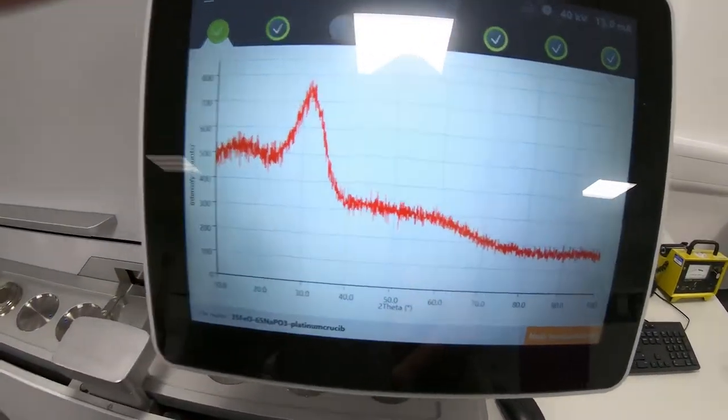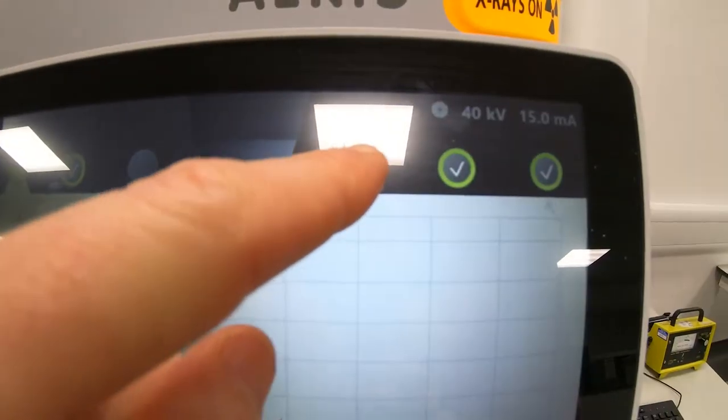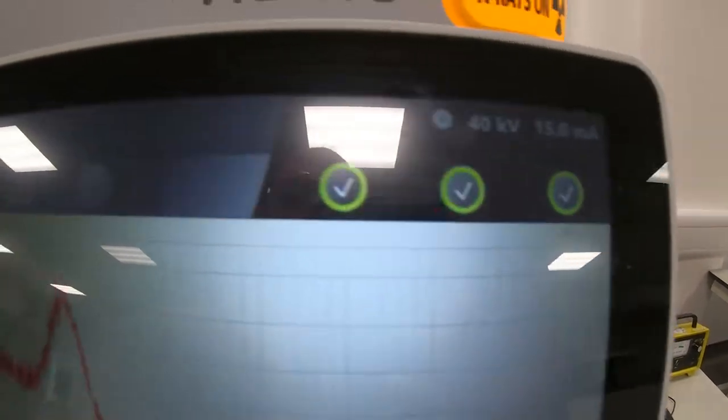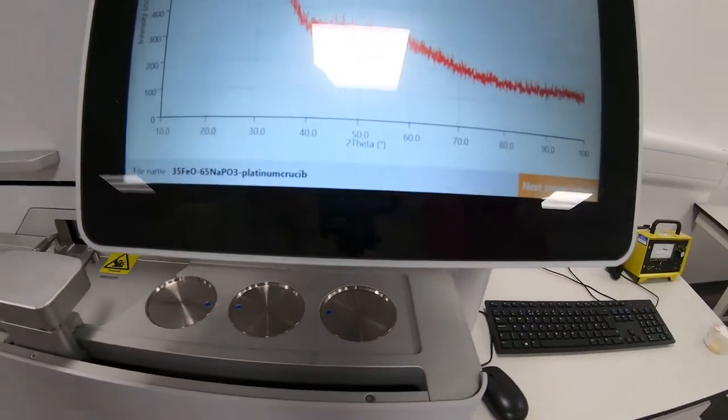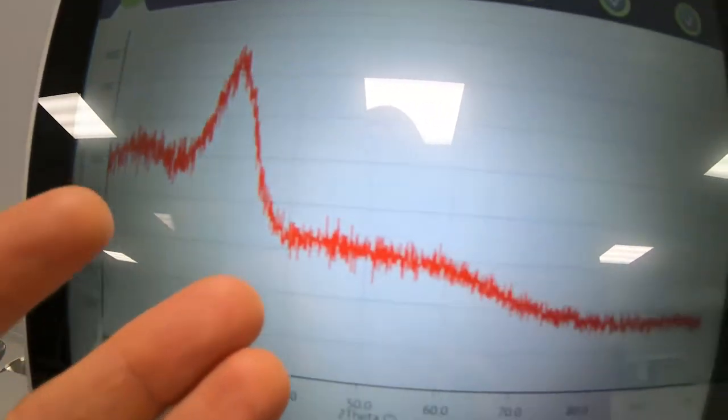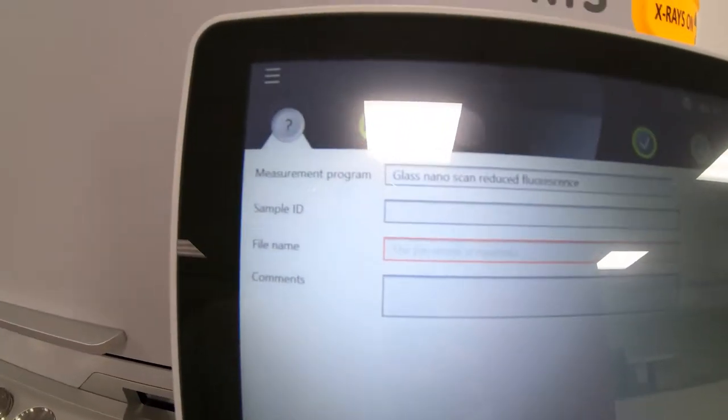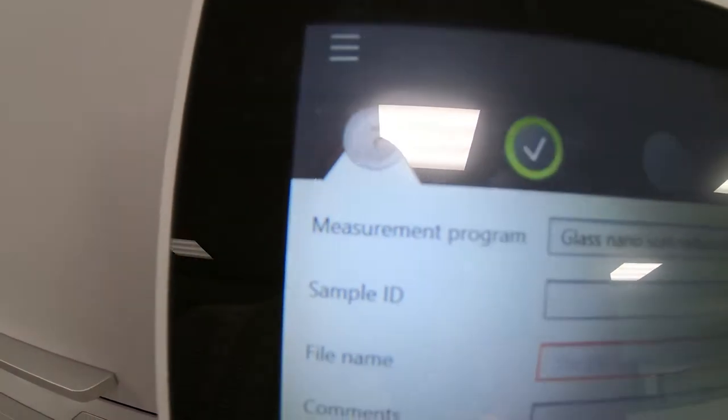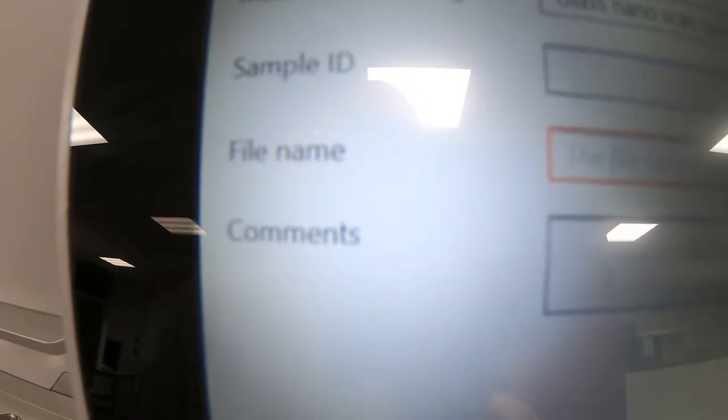So you can see on the software that there are one, two, three, four, five, six circles, and they correspond to the six sample positions that you can see. I'm on the first position, so I select the first position. This is the last experiment that was done. You can see down here it says next to measurement, so I press on that. Now this window has only a few options in it: the measurement program, the sample ID, the file name, and any comments that you might want to make.